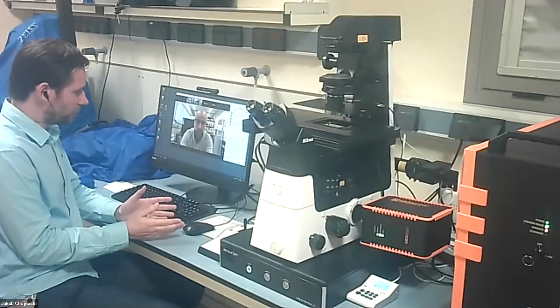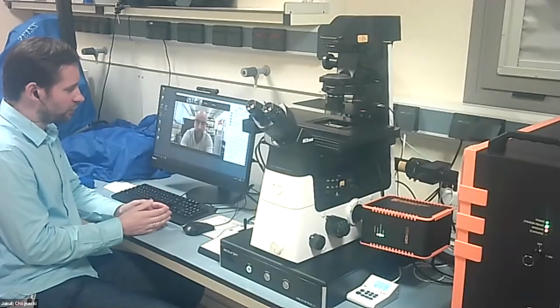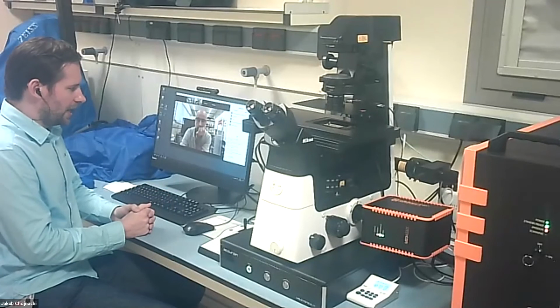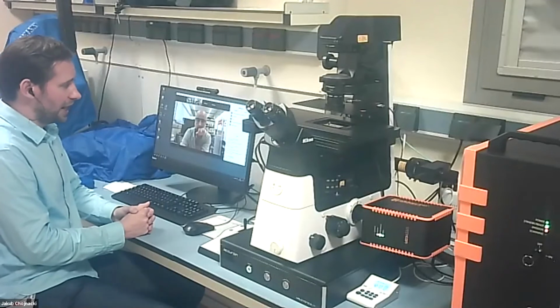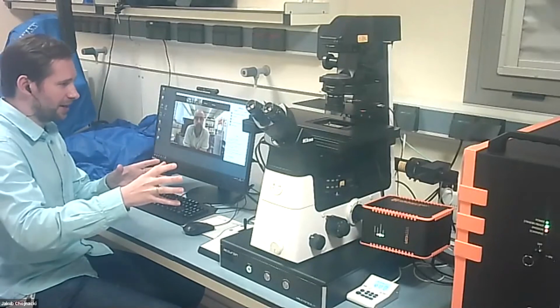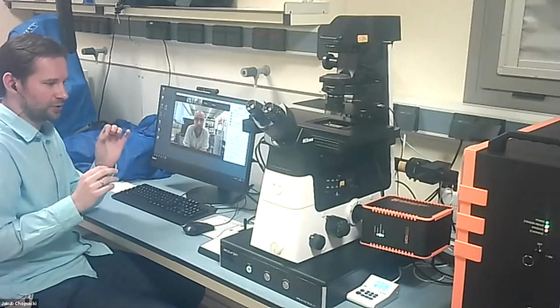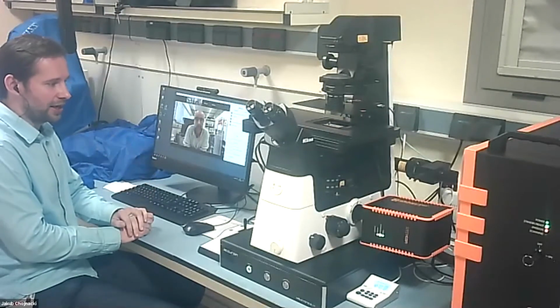The results are often different, well, not so much different. I think fluorescence microscopy has different strengths than electron microscopy. Like I was saying, with fluorescence microscopy, we can visualize specific structures a little bit better, but electron microscopy has even better resolution. So when we combine those two, you can actually get even more information. That is quite a complex field of study, because as you can imagine, combining these types of microscopes requires very, very delicate sample handling, because you have to know exactly where you have been. You have to then put it in a different instrument and then find exactly the same area.